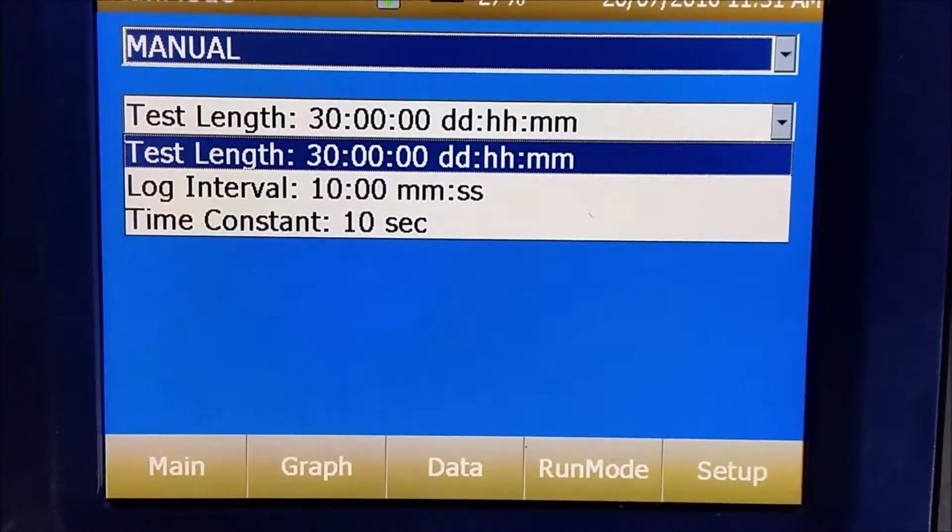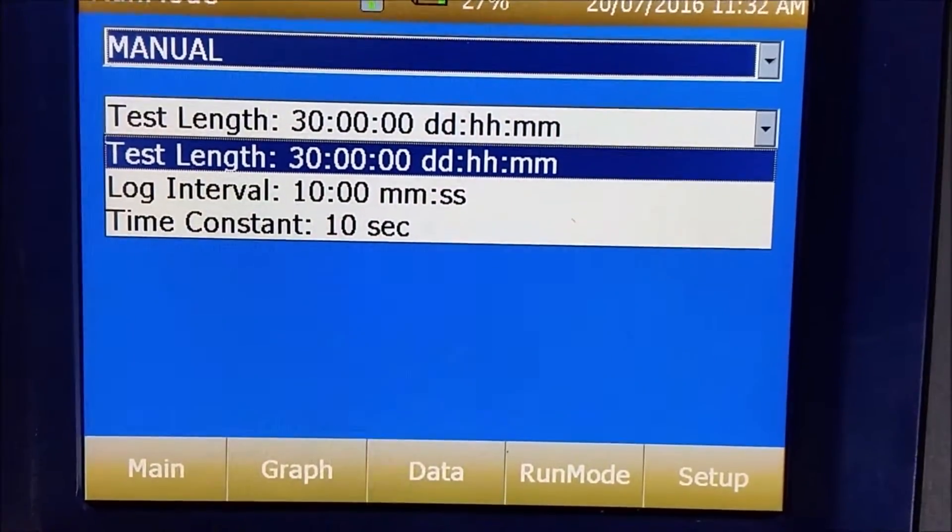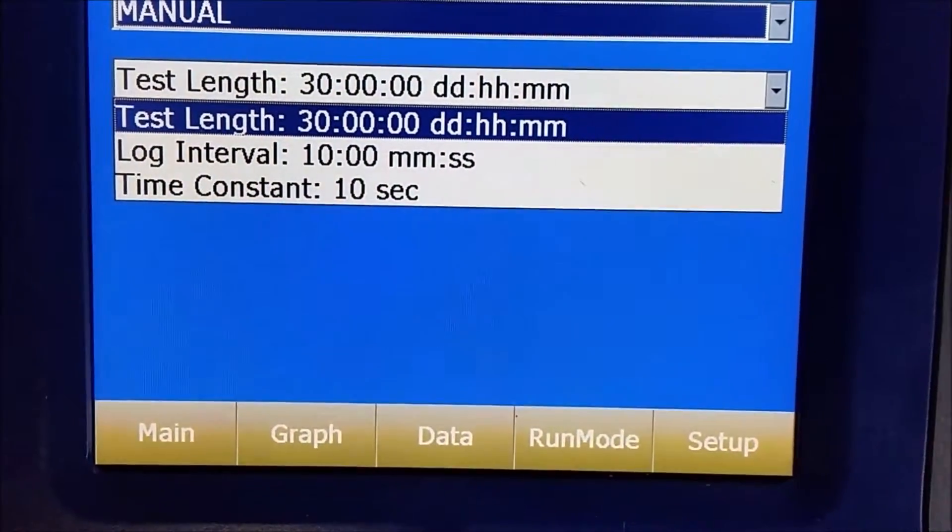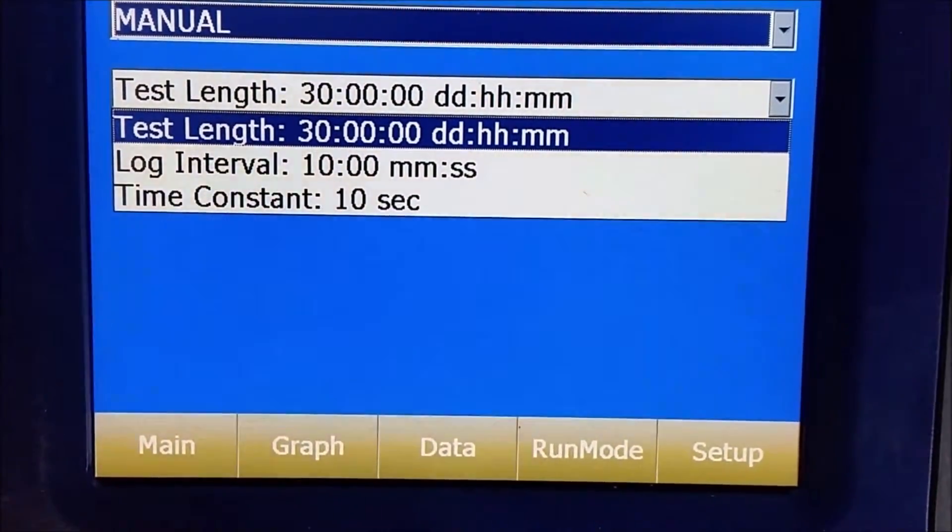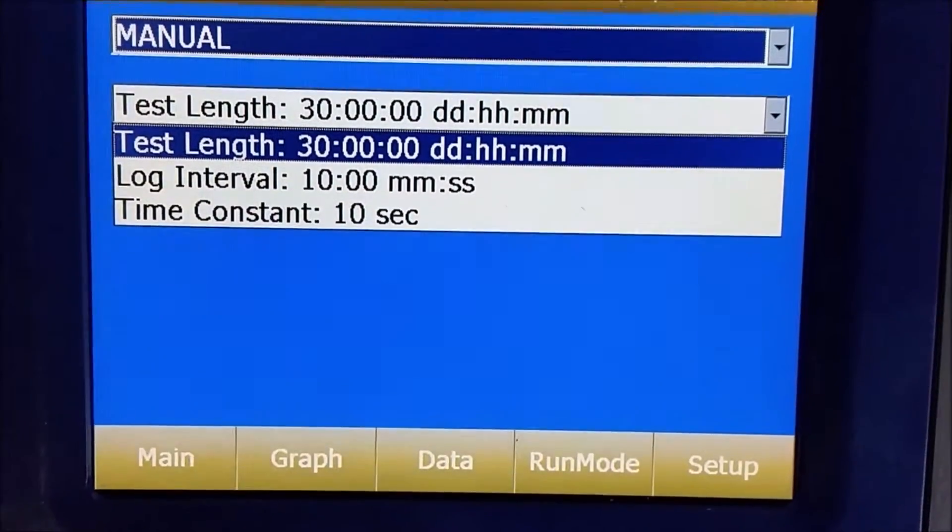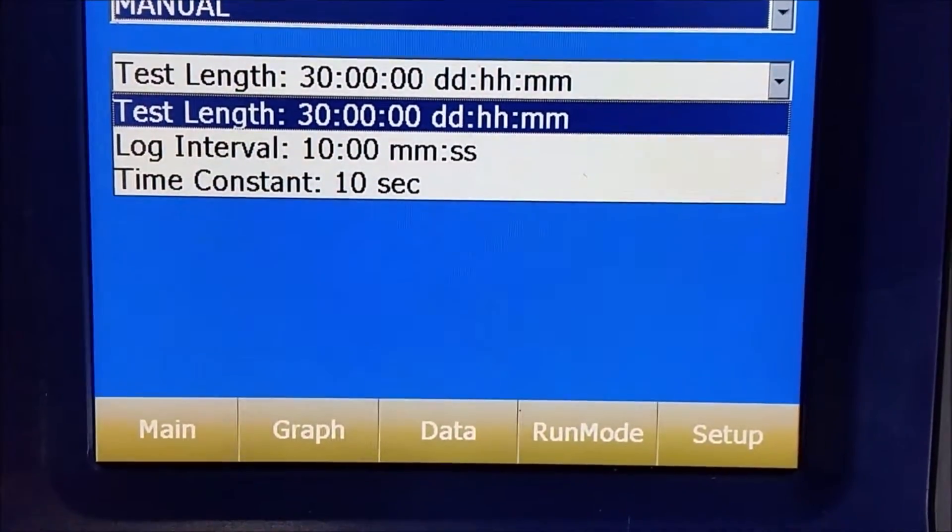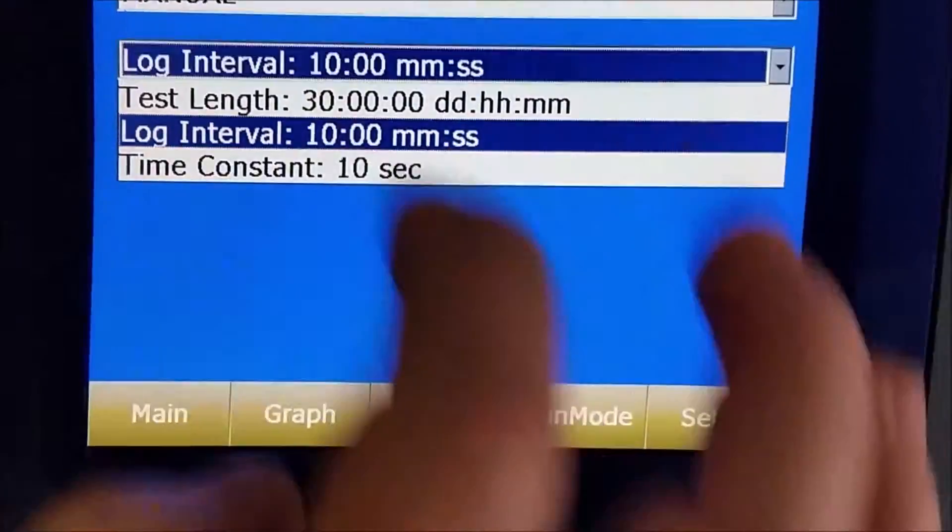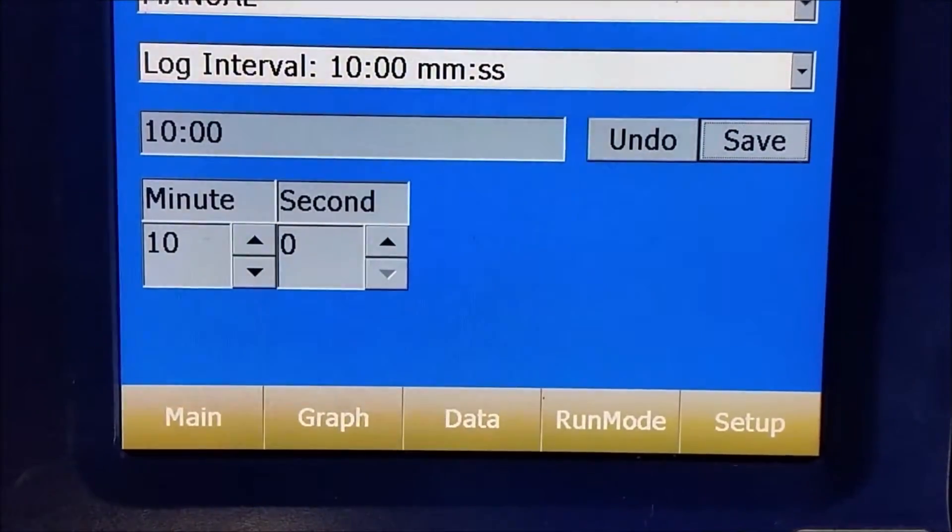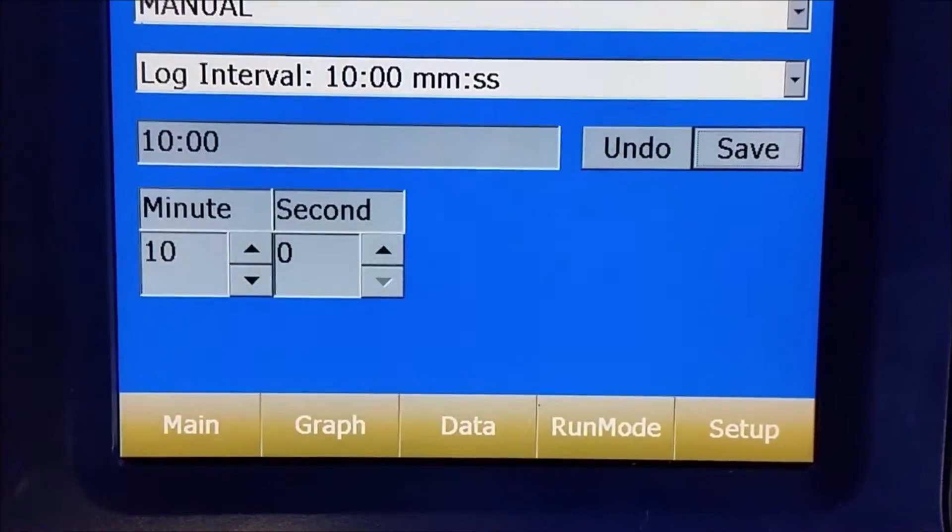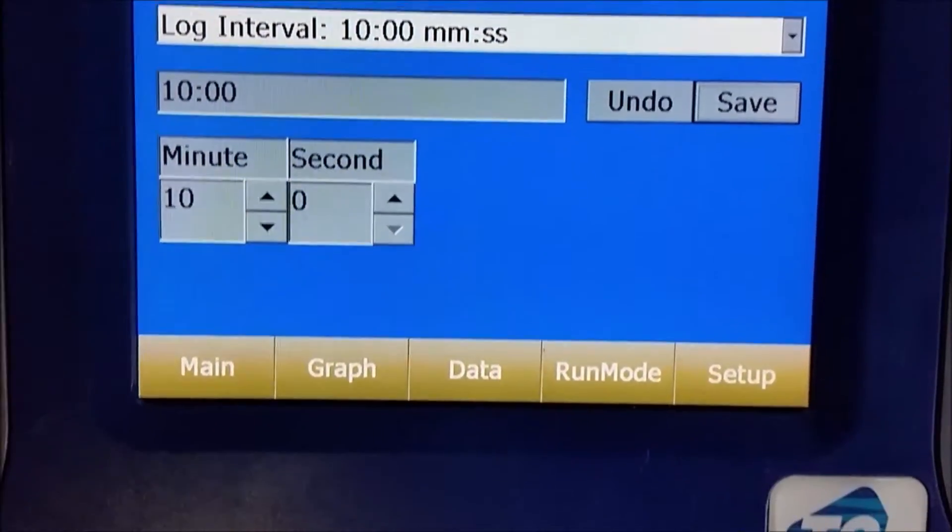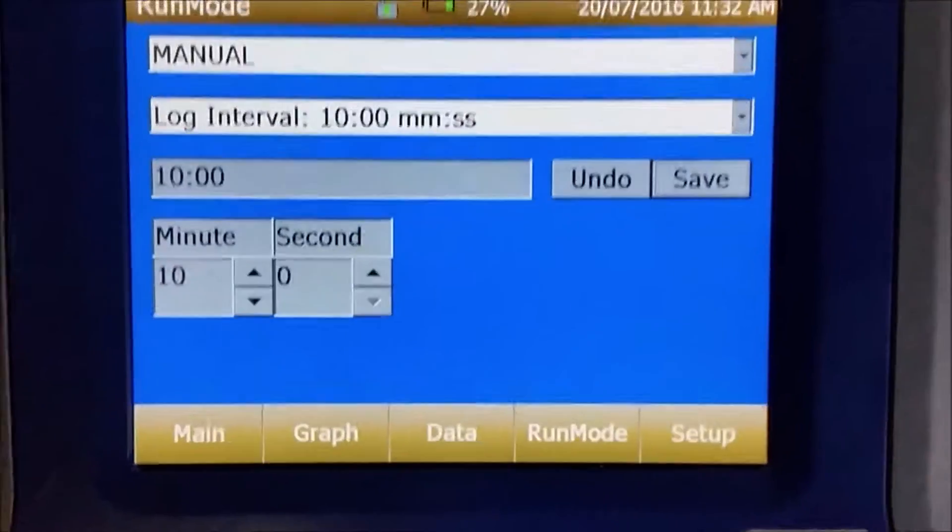And as you can see, you've got different options. At the moment, you can take a sample every 30 minutes and it will take one point every 30 minutes. Or you can have a 10 minute period of sampling and it will give you one point for that.